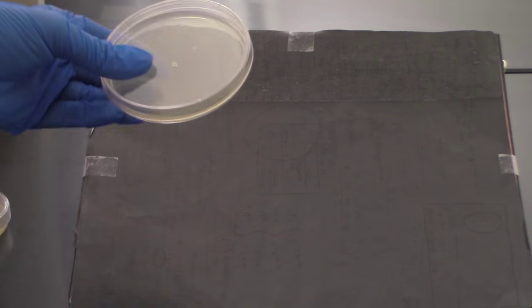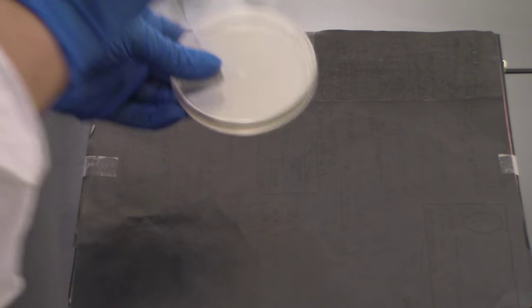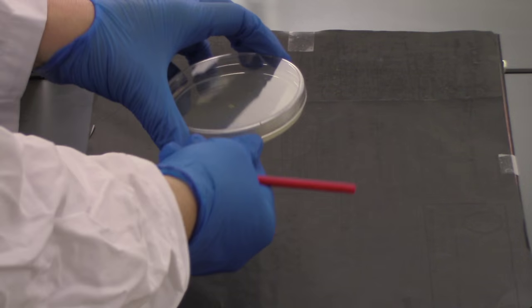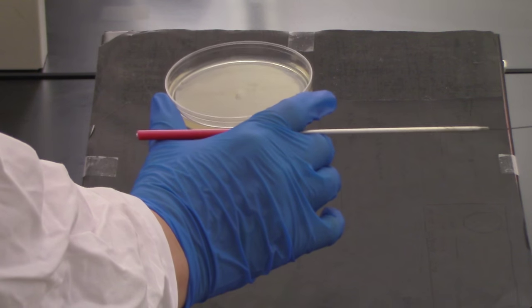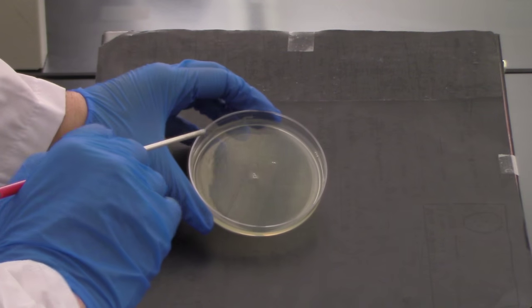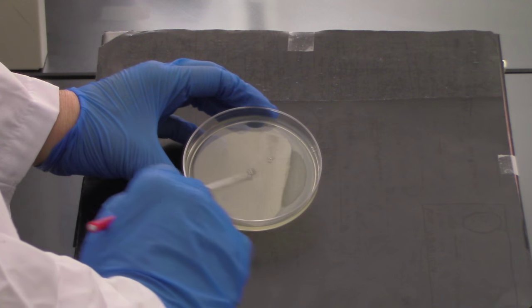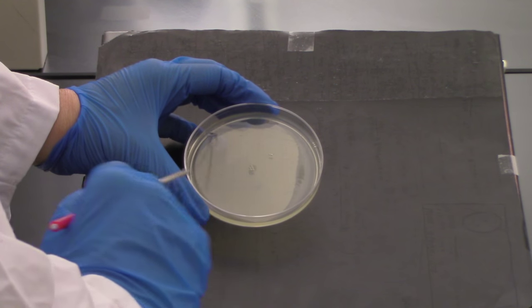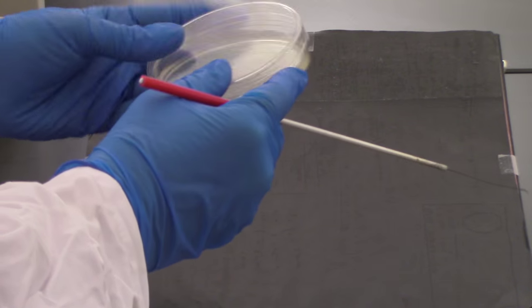I'm going to sterilize my loop and let it cool for 30 seconds. Okay, it's been 30 seconds — you'll be clam shelling yours. I'm going to go back over my one centimeter smear and thin that out: zigzag all the way across but stay towards the edge. Then close the lid again.